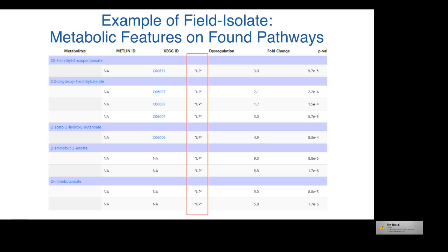And to refer to one of the questions that was asked earlier, sometimes I don't pay a great deal of attention to which order I put them in, and so it's hard to know which one is your control and which one is your example, but you can always look in the results table and find out which sample means up. So in this case, the way I set it up was in the regular, or non-treated condition.